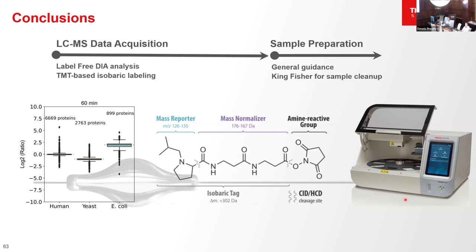So the problem is Olink and SomaScan, they don't even correlate. They measure completely different things. Their Pearson correlation coefficient is 0, meaning they're not correlated at all. So once we have to stick with one method, otherwise you cannot replicate your results at all, especially for a longitudinal study, right? So how's yours compared to, let's say, Olink and SomaScan? Like the correlation, the reliability, and the validation?